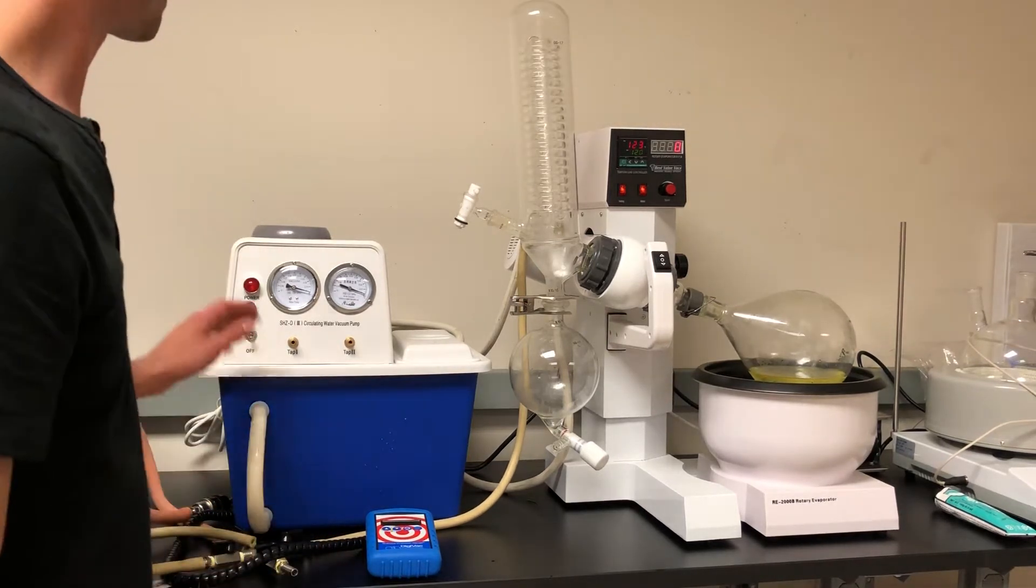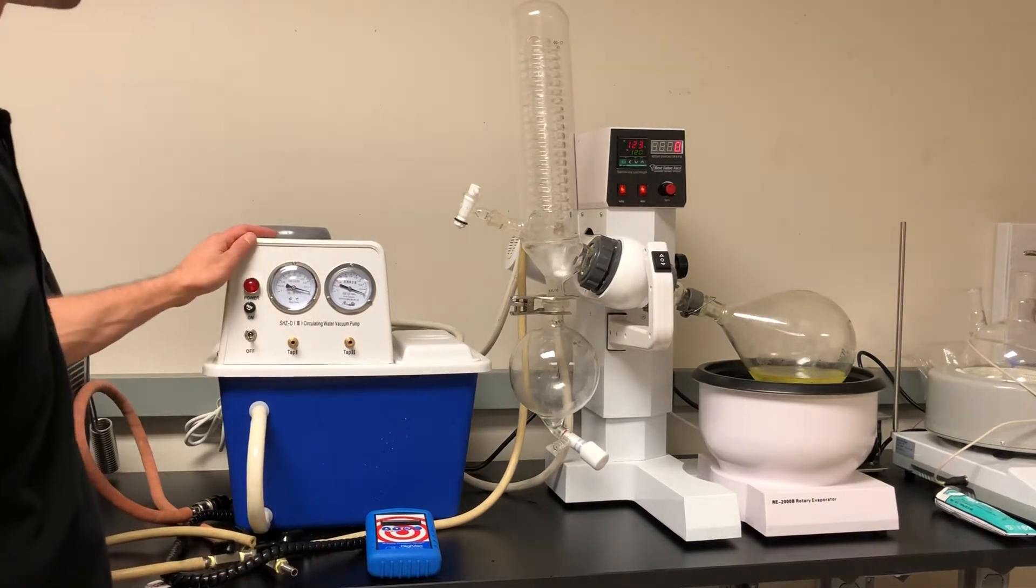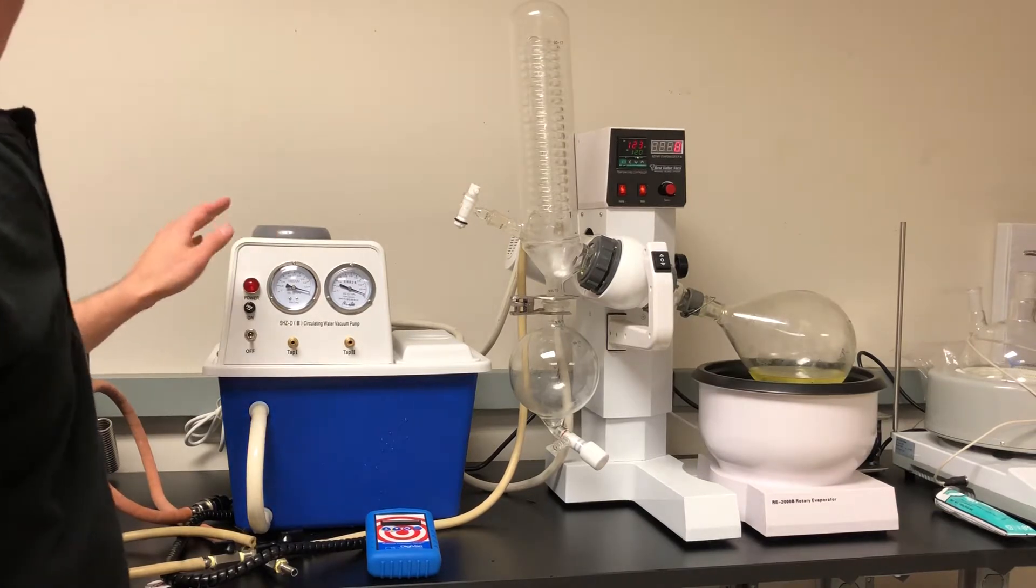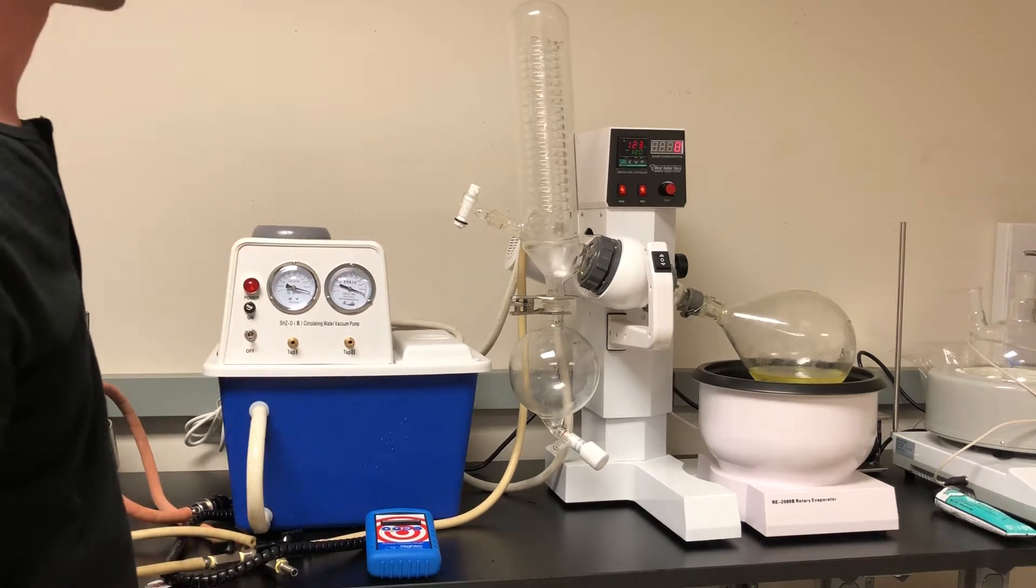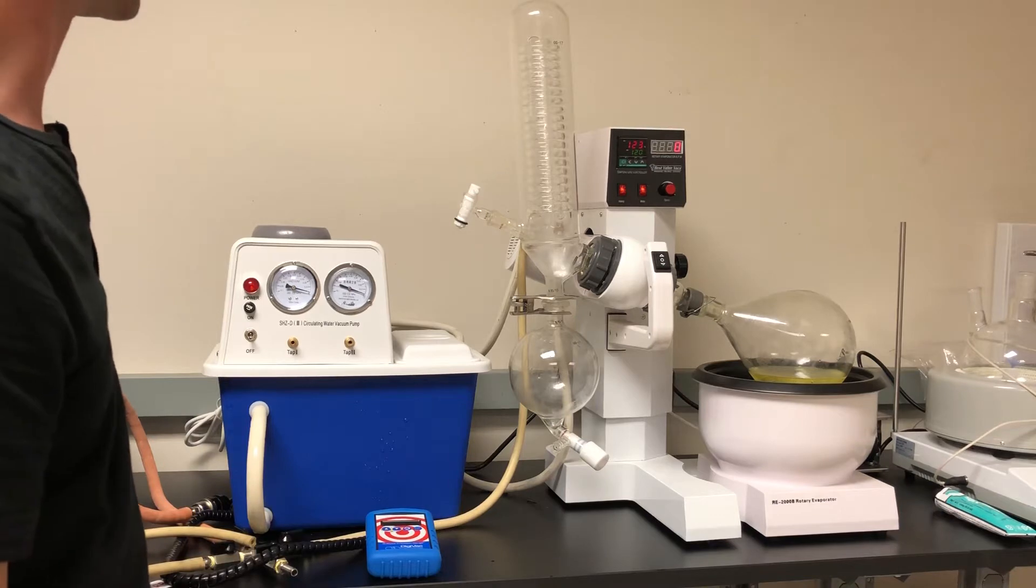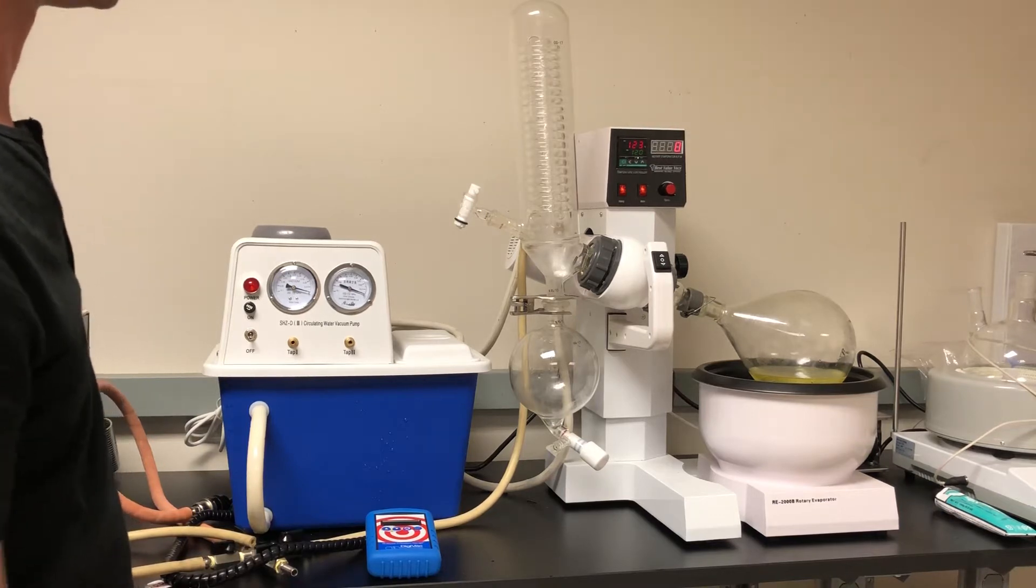Hi guys, I wanted to put together a quick video. I want to talk about the water circulator vacuum pump that we sell. It's a nice little tool to have inside the lab. You always have a lot of people that ask questions about it just because it's such a simple device.